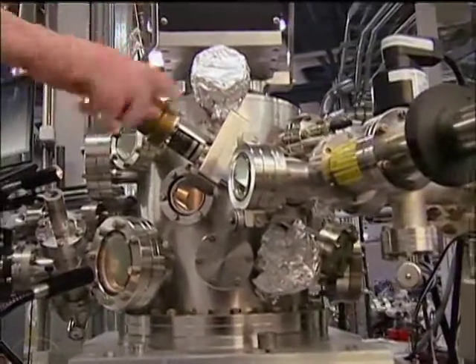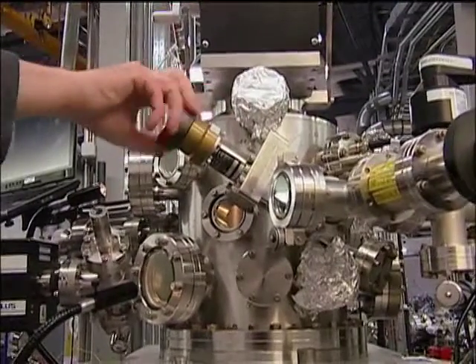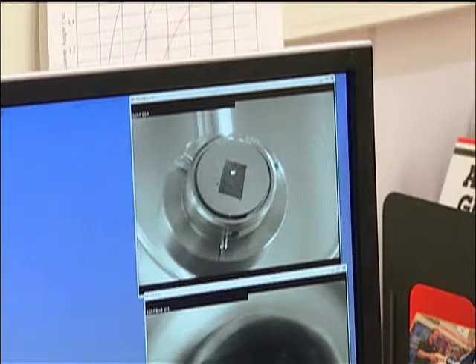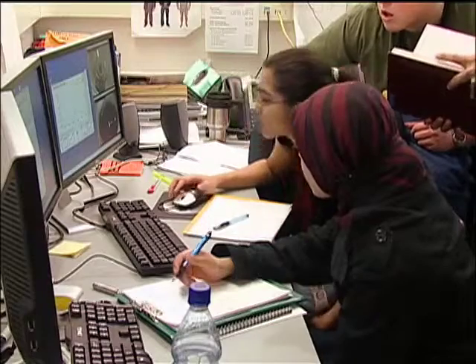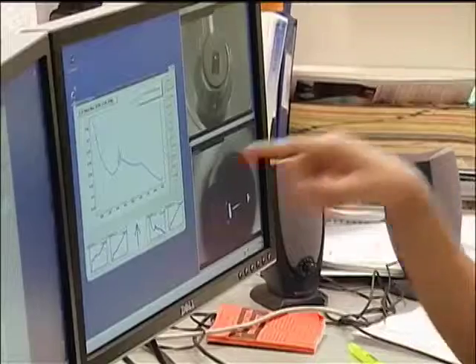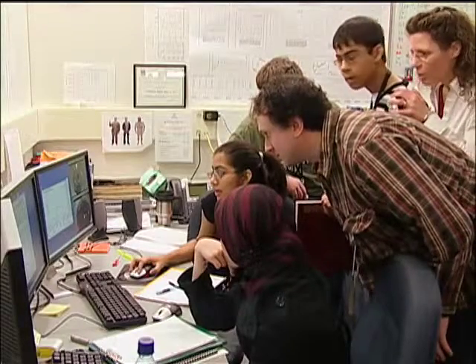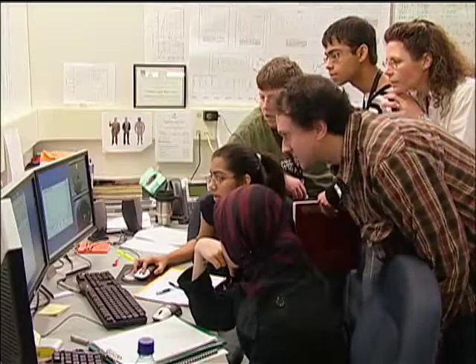Next, Dr. Blythe must draw down a near-perfect vacuum in the beamline before the shutters can be opened. When they do, light energy in the form of soft x-rays hits the target, sending vital data about which trace elements are showing up in the sample to the computer screens. Students, teachers and mentors gather round to analyze the data and decide what elements to search for next.